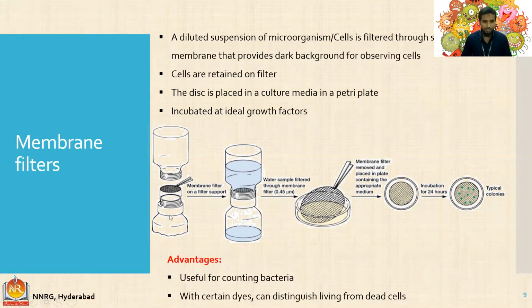You can see this image. This is the collector of the solution, and it has an opening at one end, and this is a membrane filter. When it is attached, the suspension will be added from the top. Okay, as a result, the solvent comes down and bacteria will be retained on the membrane filter. This membrane filter is taken using forceps. We cannot put our hand on it. Okay, it might be contaminated, so we might get contaminated and get different infections. So we need to use forceps and place it in a petri plate.